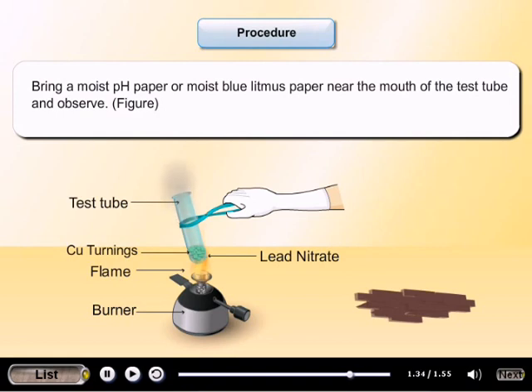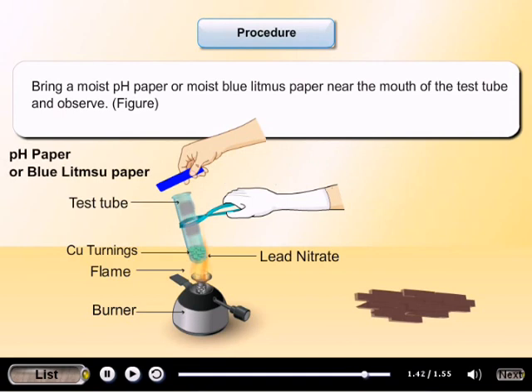Bring a moist pH paper or moist blue litmus paper near the mouth of the test tube and observe. Bring a glowing candle near the mouth of the test tube.